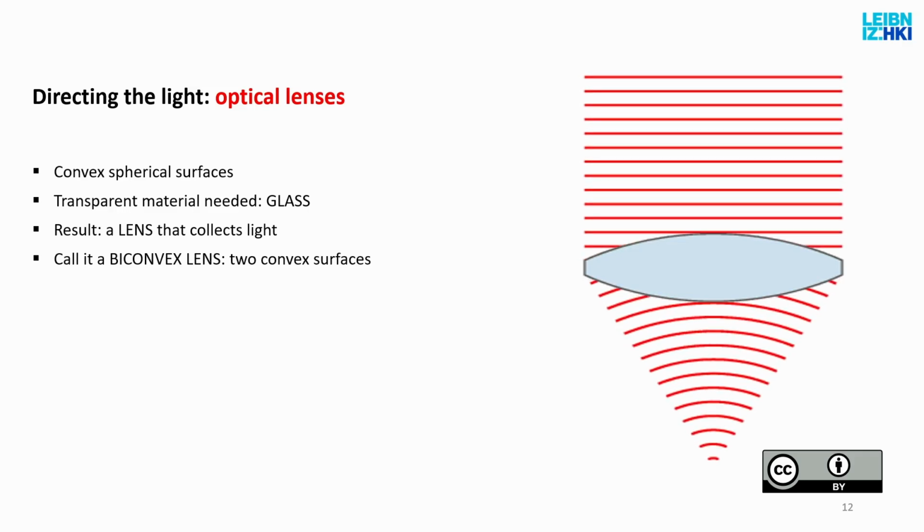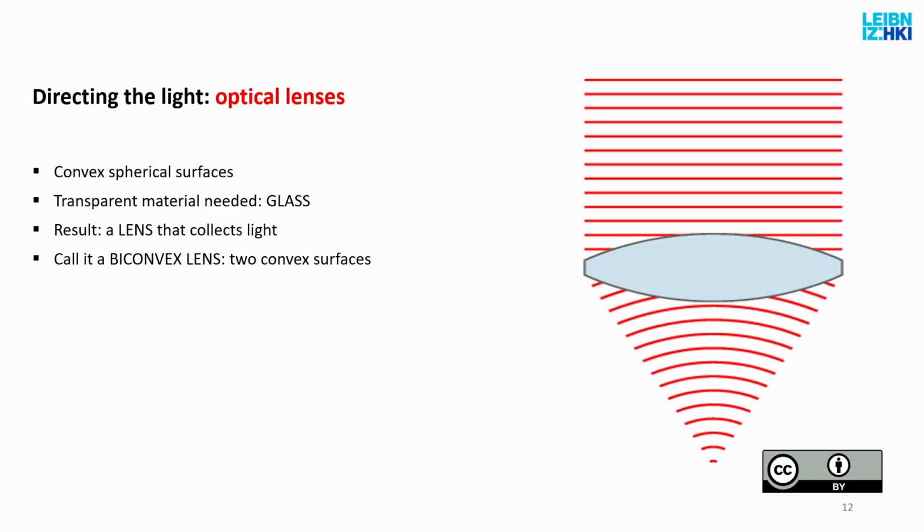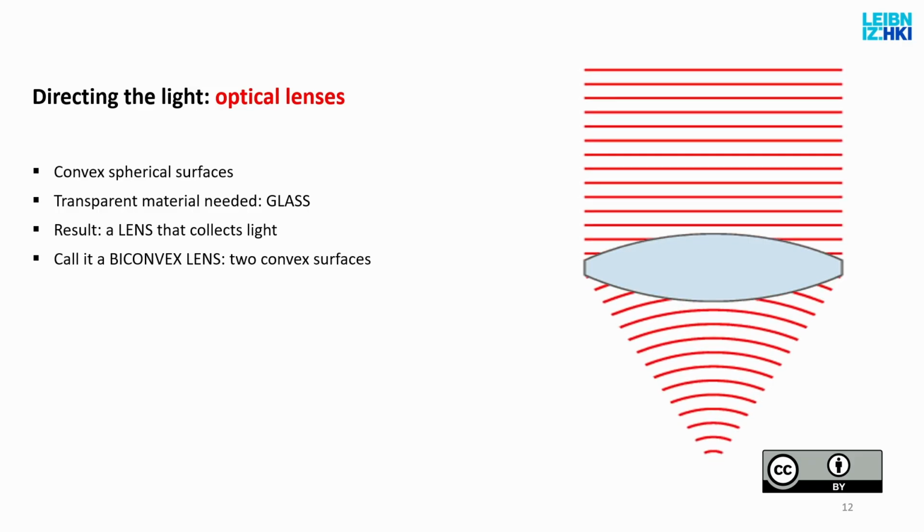Because what this will do is, if I have two equal radii spherical surfaces, it will take a parallel light beam and merge it into one point, a process called focusing. So from this simple law that we just saw, we were able to imagine and then generate an optical element that will focus the light. Now we are getting towards optically useful phenomena.